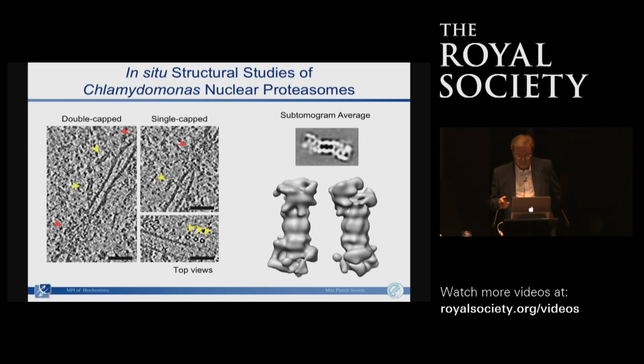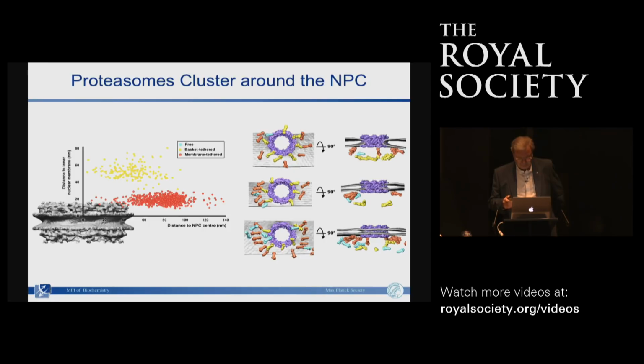as I will illustrate further on. And then we can distinguish whether they have one or two regulatory particles associated. We can infer, as I said, from the conformation whether they are engaged with substrate or not.